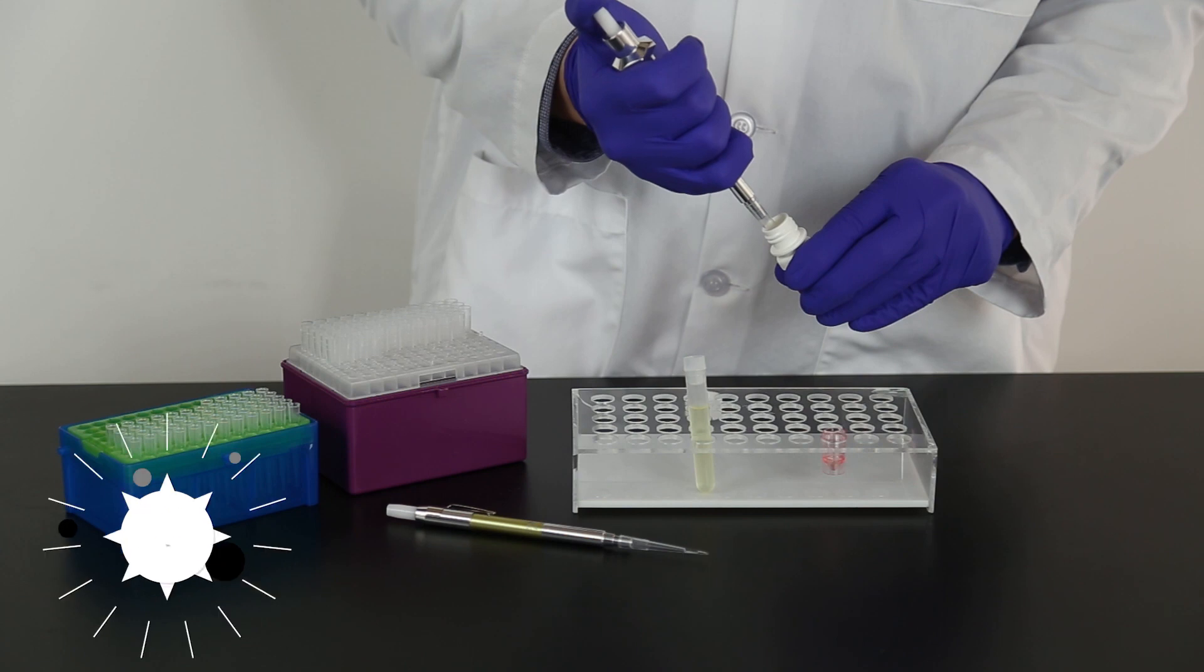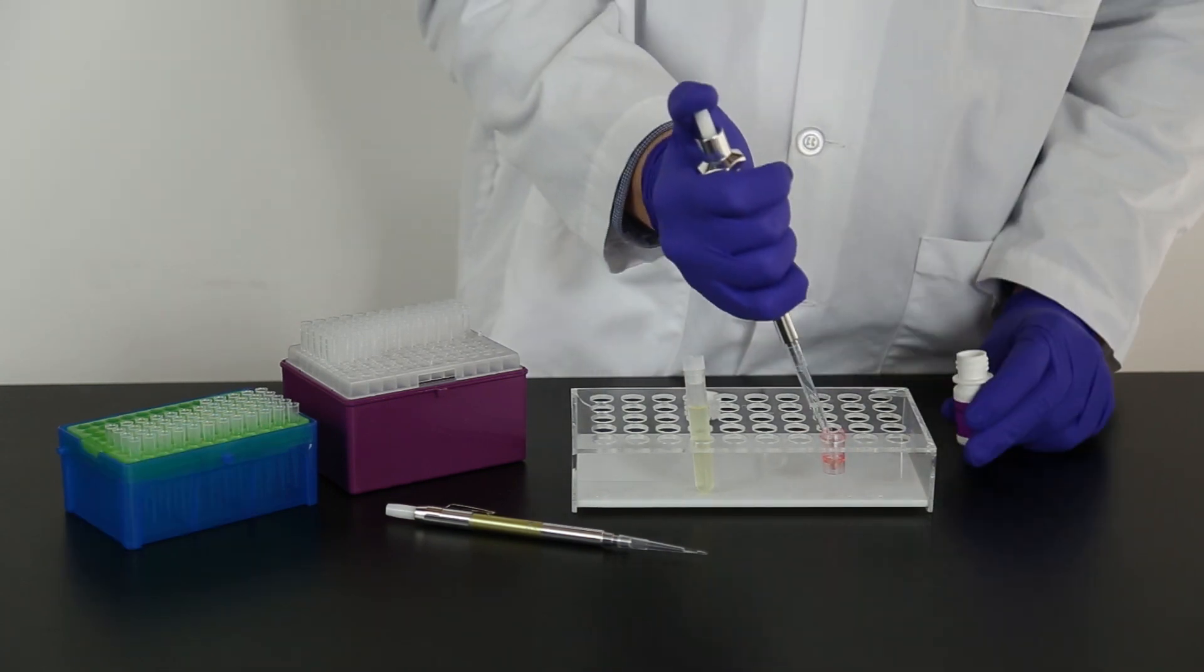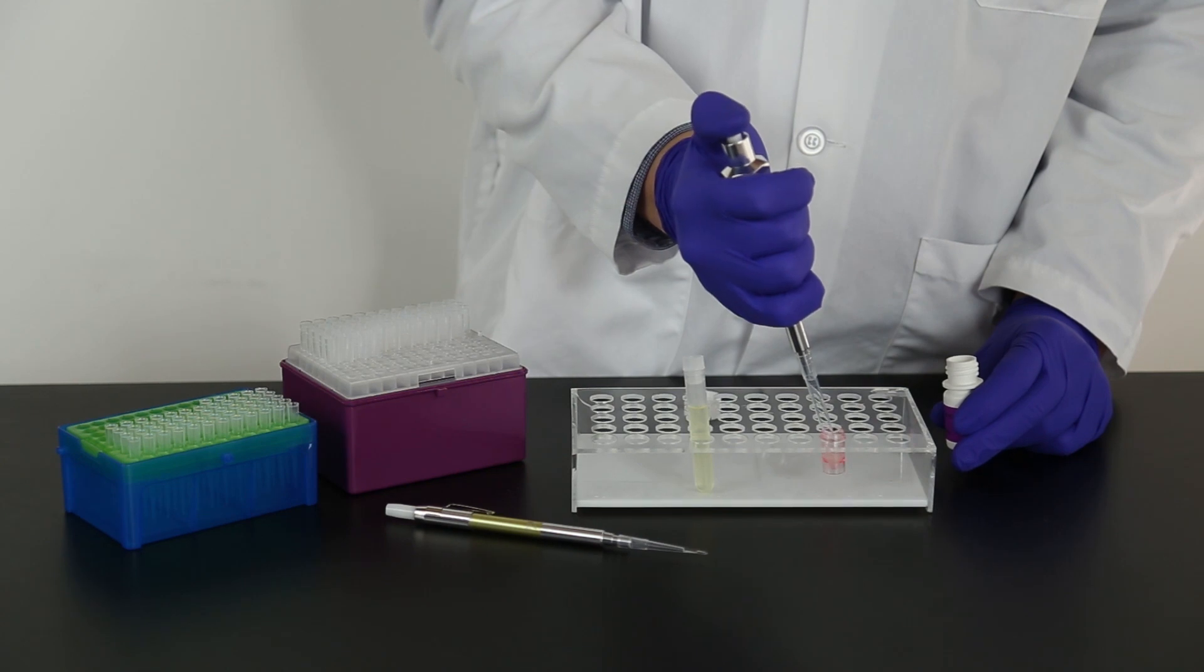Next, add 400 microliters sample diluent to the sample cup. Mix by pipetting up and down five times. It is important to mix thoroughly.